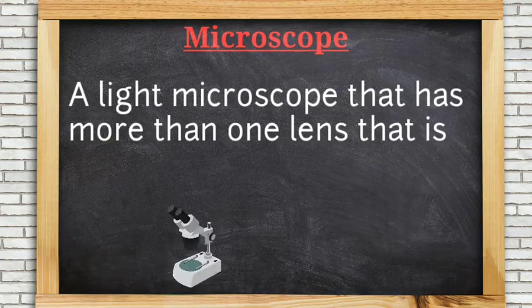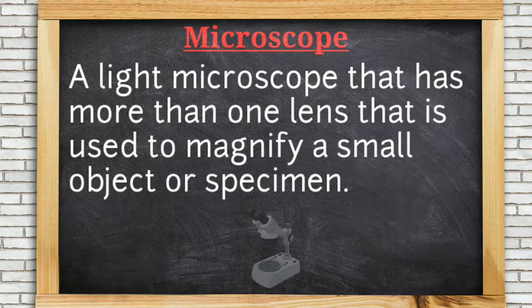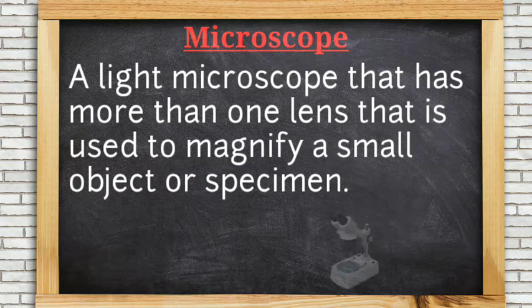A light microscope that has more than one lens, that is used to magnify a small object or specimen.